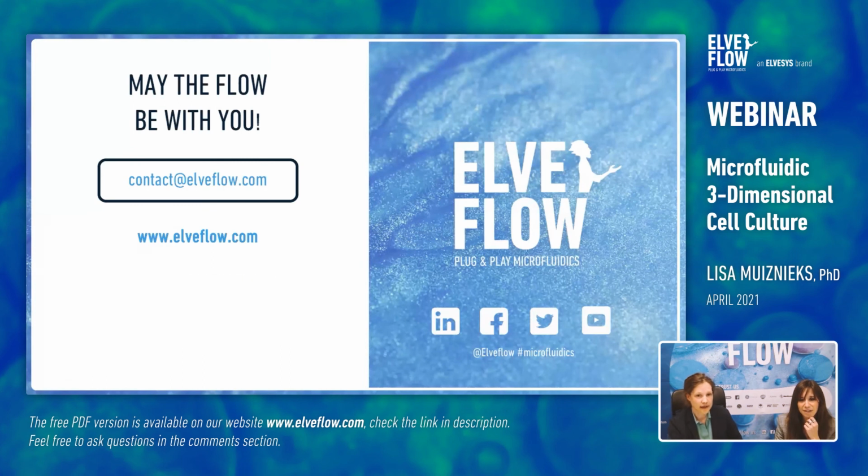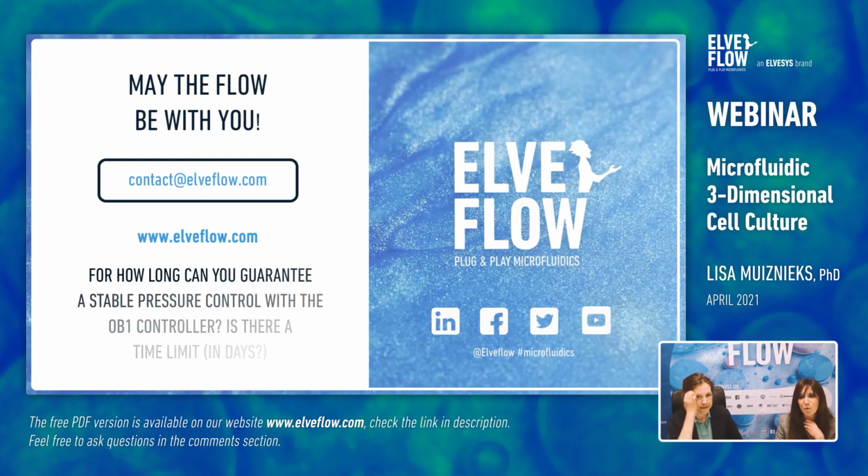Clarissa Bescher, thanks a lot for the question. Thanks for the talk. Do you know for how long can you guarantee a stable pressure control with the OB1 controller? Is there a time limit in days? So actually, you can really perform longer-term experiments with the OB1, and I let Lisa tell for how long you can run experiments.